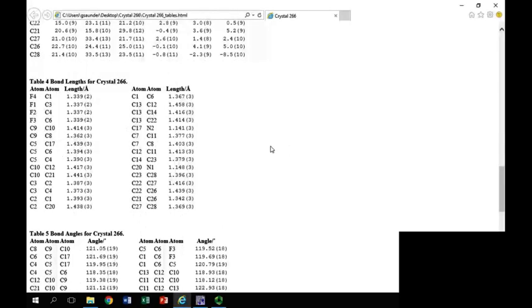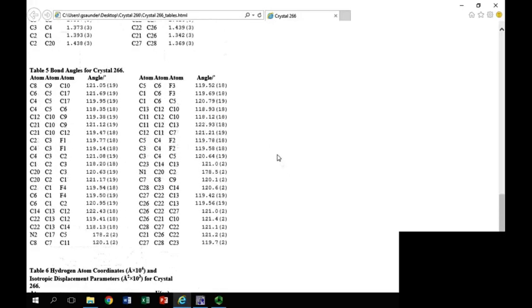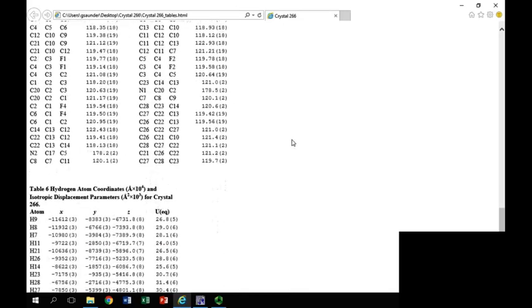bond lengths. Again, don't just copy and paste. It's the important selected bond distances I want you to put in the table. Okay, but just copying and pasting, you're not actually thinking about which ones are important or why. Think about which ones are important. Don't put in the carbon-hydrogen distances, and you know why, or angles. And then we've got all the angles as well. These are also contained in the CIF, so you can get them out of there as well. Remember to include the ESDs, standard uncertainties, because they're important.